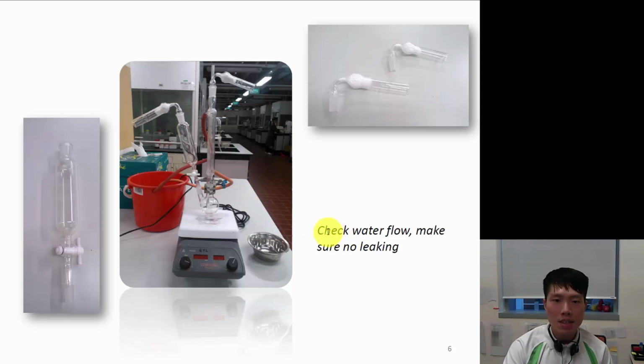And next thing is, you need to check that the tubing is not clogged, and of course it's sealed to the condenser, because if it leaks, right, again water goes inside the flask. GG for you. So these are the things you have to check, you know. Don't just focus on one particular segment. You have to be very careful about everything that you set up.